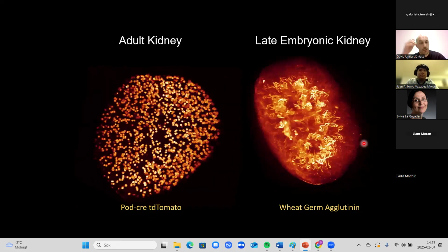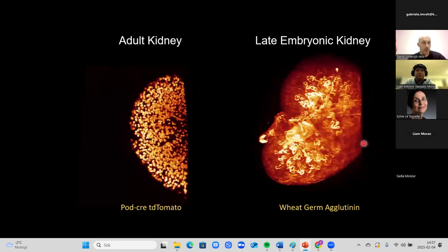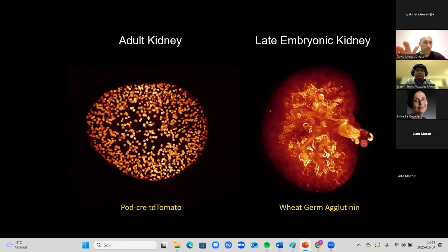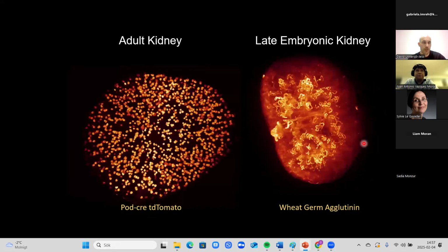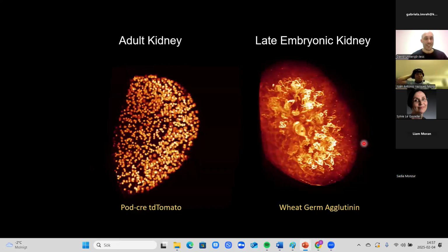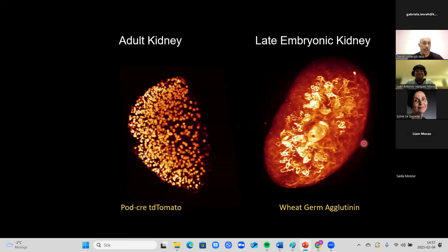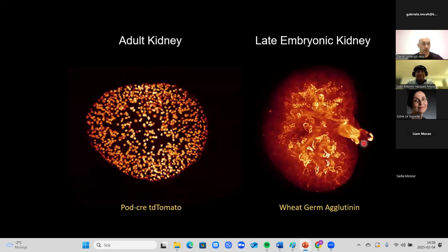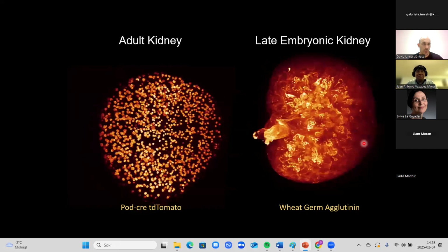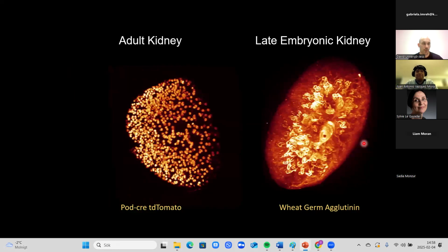So these protocols that I use will all swell your sample a little bit. This is anywhere between 20% to 50%. And this is good for some applications. You will see this later. I mostly do high resolution or super resolution imaging, and then you actually get a little help from this. You get a little resolution improvement from this swelling of your sample.